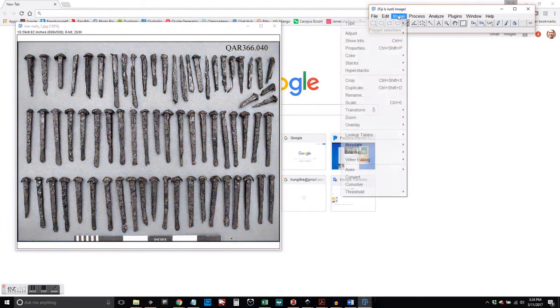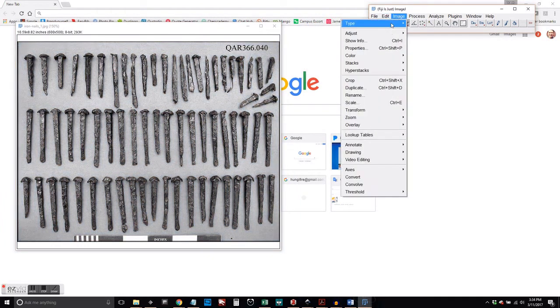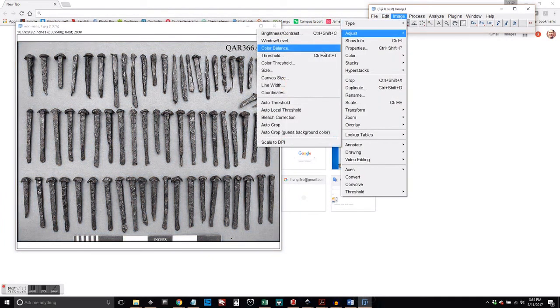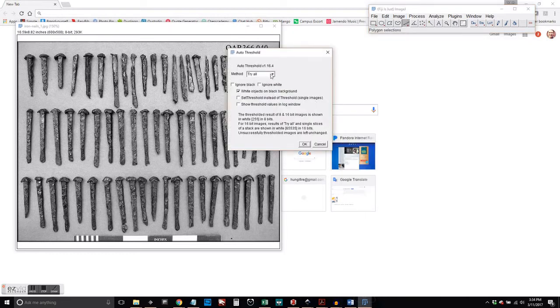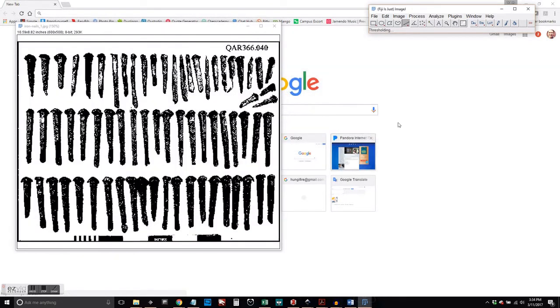Now we change it to 8-bit. And we're going to do Auto Threshold to give us that black and white, that contrast.